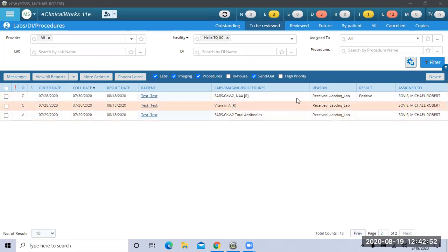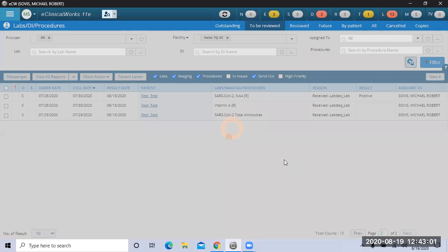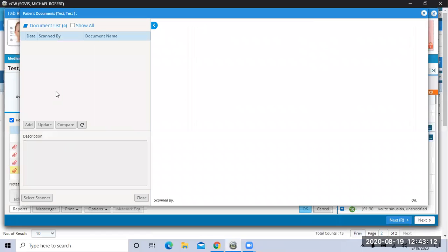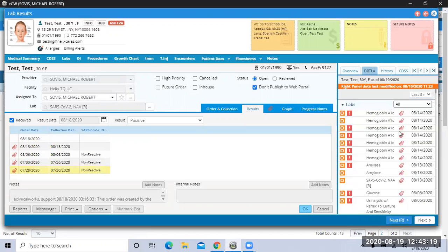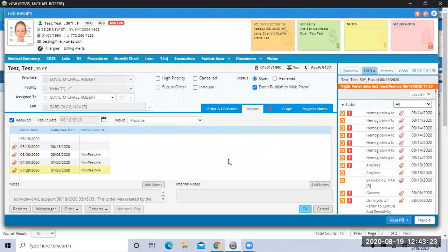So you come in the morning and this whole page is full, next page is full. You're going to start obviously on the first one. And let's just say that this is a urine. PHR now is going to be integrated, so hopefully all the stuff will show up here. But if it's not, always remember you can come over here to reports as well. You can come over to this side and click the paperclip and see the report. So those are the spots you would look.